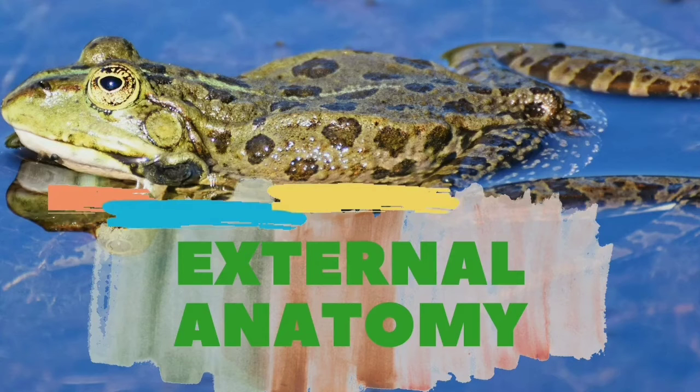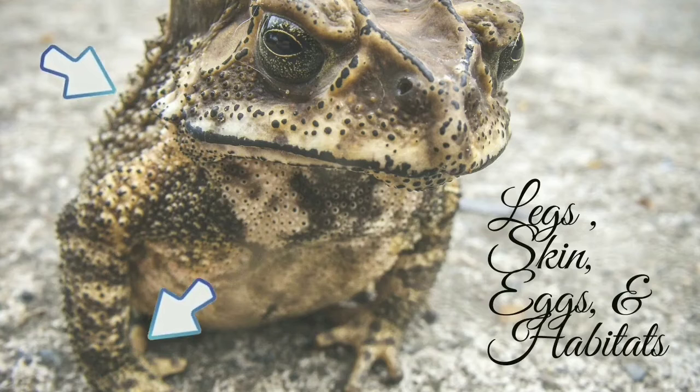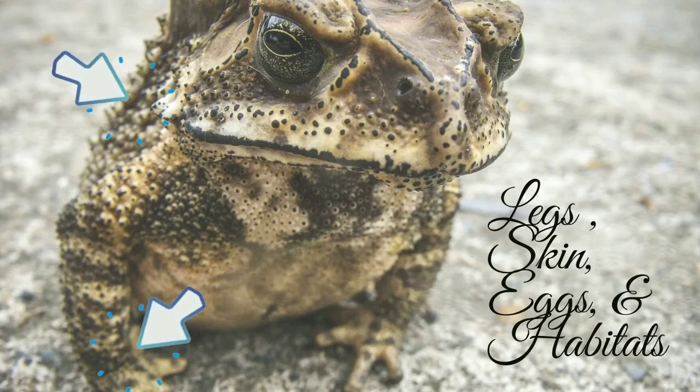External anatomy of a frog. First, we're going to be differentiating frogs from toads. We're going to differentiate them based on their legs, their skin, eggs, and habitats.